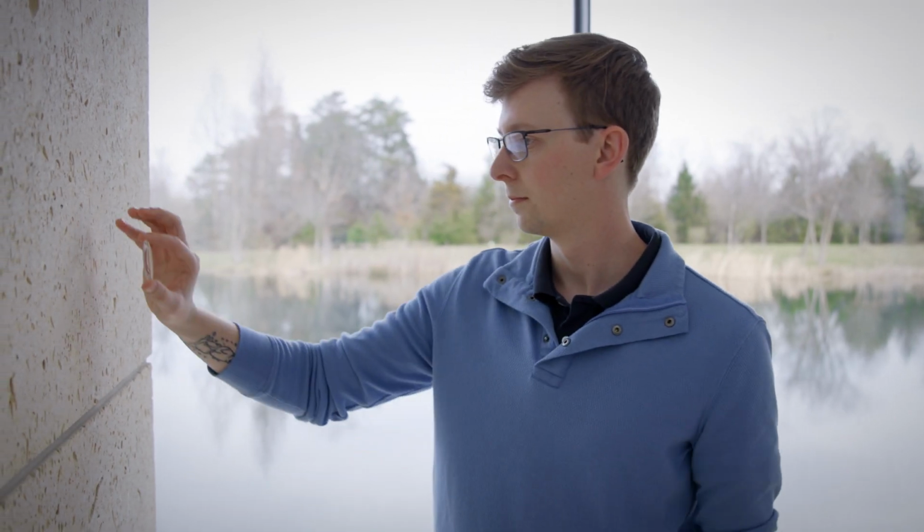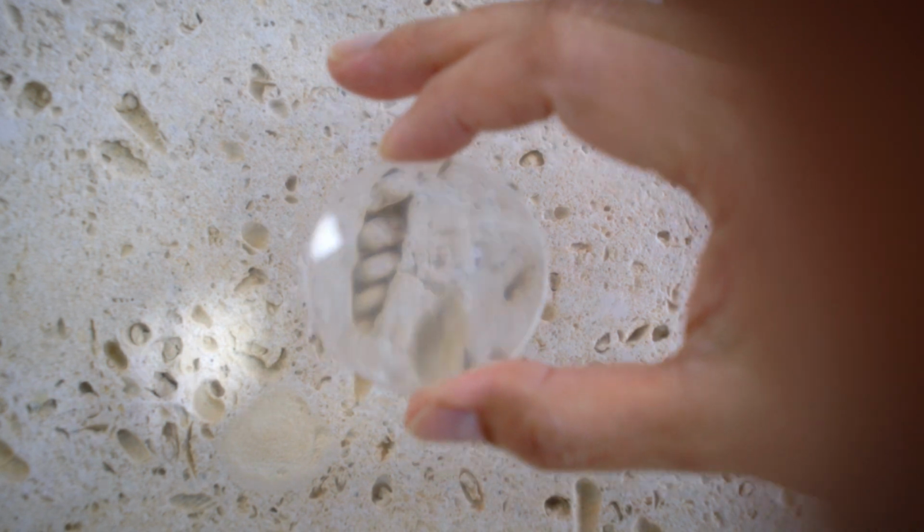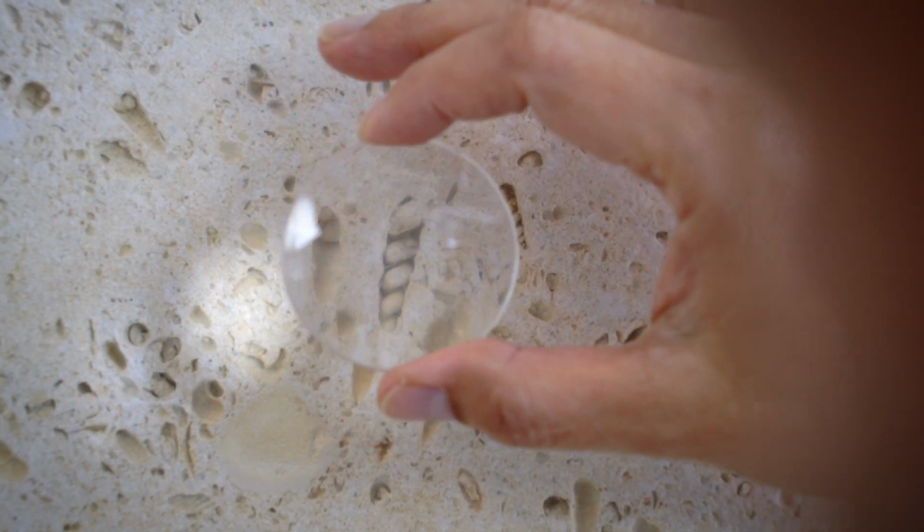You have to hold them at just the right spots. You have to put your eye in just the right spot. And depending where you hold it, things get bigger and smaller. They go out of focus. And these are small annoyances for everyday kind of exploration. But if you're trying to do rigorous, reproducible scientific experiments, these are extremely problematic.